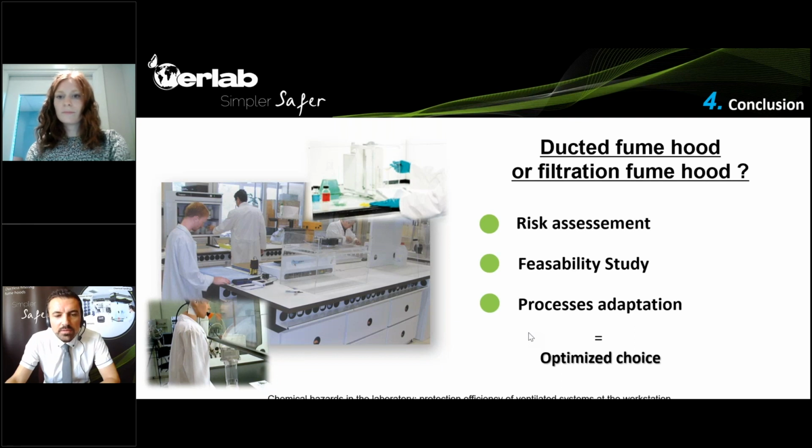And you also have to know, Kate, that some powders, I know that we are really in your topic, knowing what you could do under fume hoods, but some powders you are not allowed to handle under a ducted fume hood. There is an official classification.